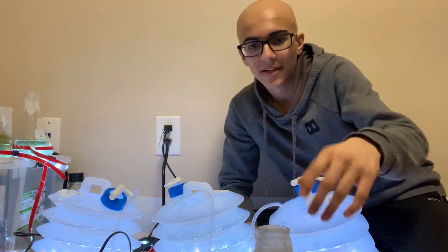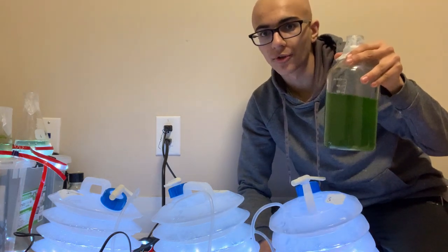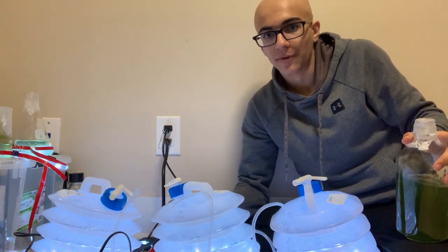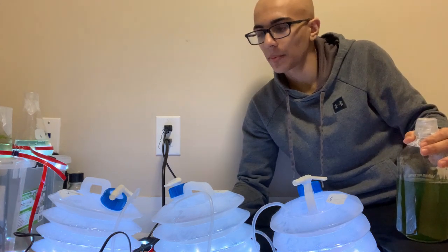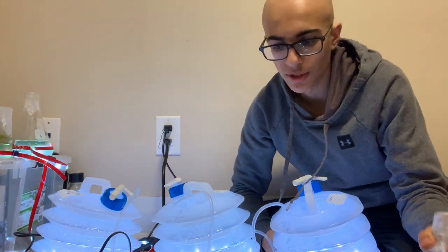And now, the time has come to get the algae into the bioreactors. So this time, in addition to having really concentrated algae, I'm also putting 200 milliliters of algae into each bioreactor, which is way more than I started with last time. And really the whole goal is just to get results faster and get the algae to grow faster and remove nitrate and phosphate faster.